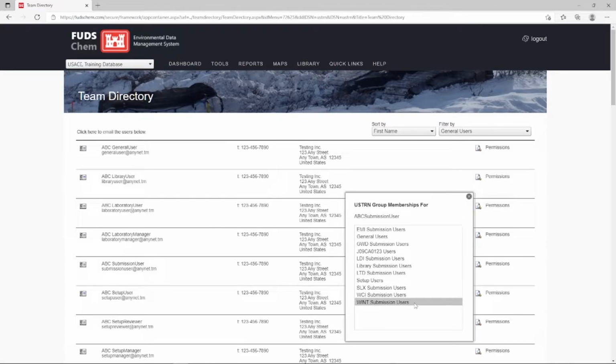Non-laboratory data types may include location, groundwater elevation, well stabilization parameters, well construction intervals, etc. In addition to submission of the electronic data, these users are also responsible for delivering supporting electronic documents, PDF, into the project library.